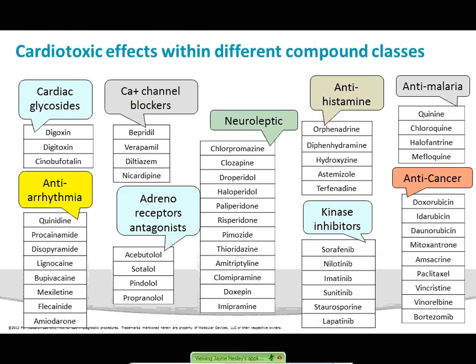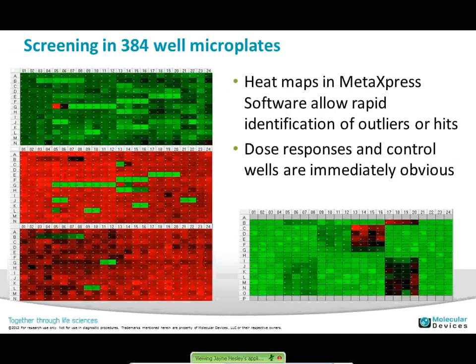We purchased a targeted compound library for cardiotoxic effects and tested those in 384-well plates using these induced pluripotent stem cells. Heat maps from MetaXpress software allow you to quickly see where you have outliers — potential hits. The compounds were run in duplicate, and you can view different parameters: nuclear size, mitochondrial membrane potential, cell density, and so on. Dose-response curves are readily apparent in the heat maps — for example, columns 13 through 16 run in quadruplicate, starting at a high level at top and decreasing going down.